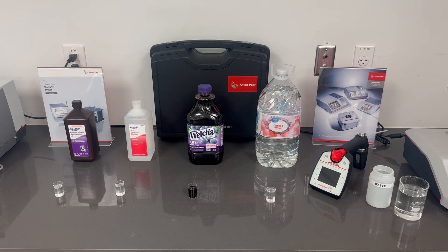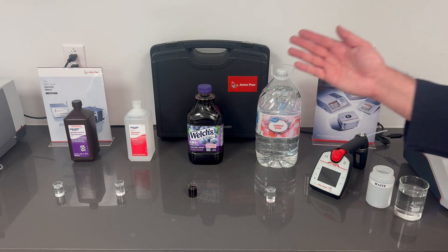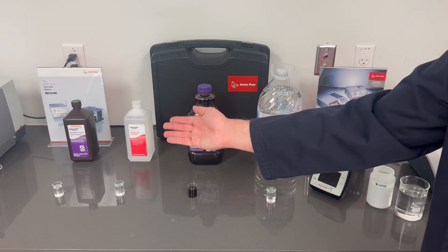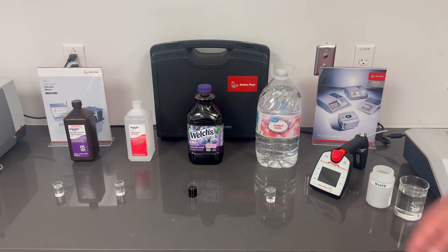Now we're all set up to run some measurements. We're going to start off with some distilled water to make sure our device is calibrated. Then we'll move on to some grape juice to see the Brix content and specific gravity. Finally, we'll do IPA and hydrogen peroxide for our concentration checks. Let's get started.